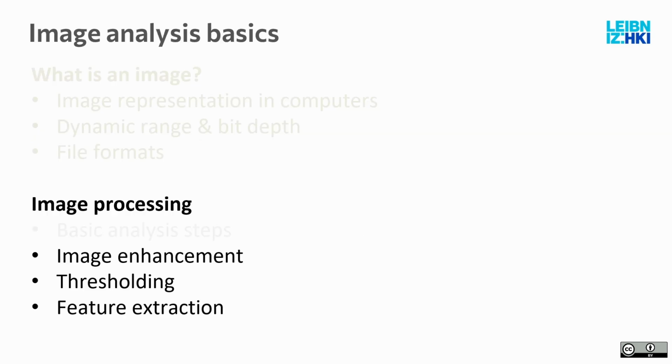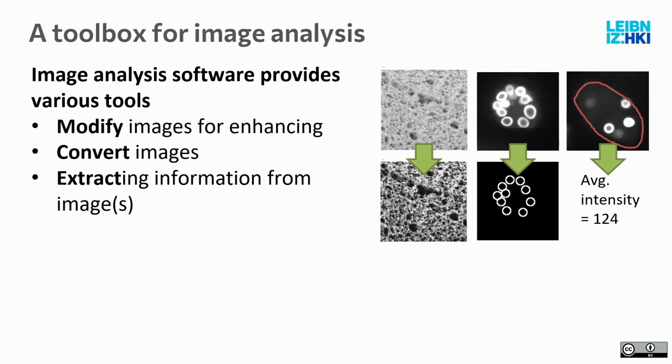So let's start to go through some operations so you build up some knowledge of what you can do. This is in no way complete, but a good start. You can read up in literature and online, and there are also many tutorials on what is available as operations and different tricks that you can apply. So let's start with image enhancement. You're basically building up a small toolbox.